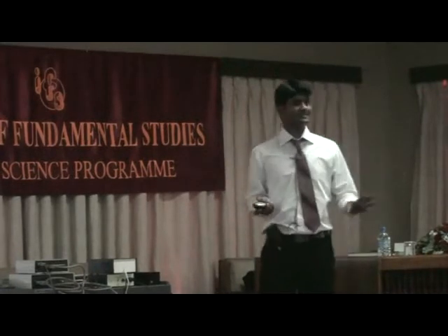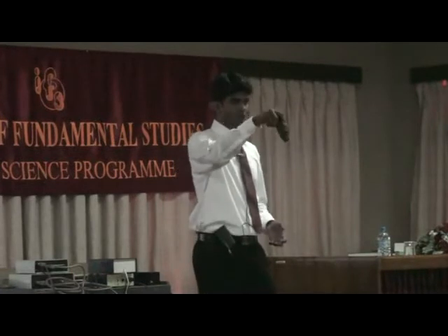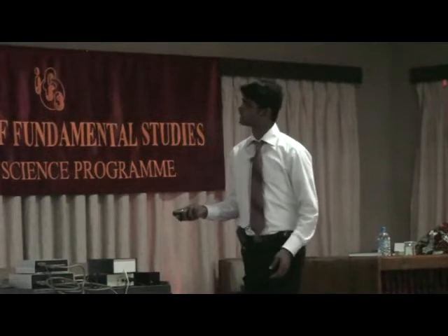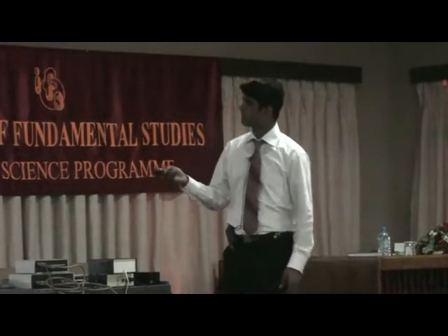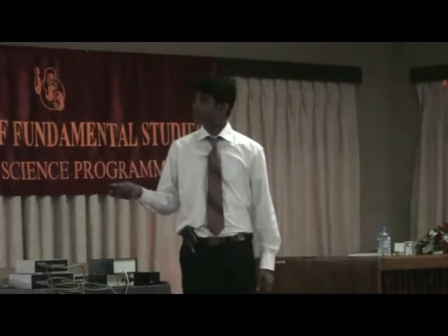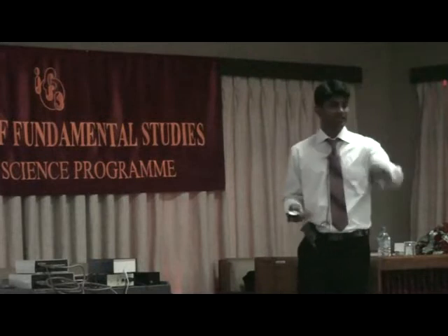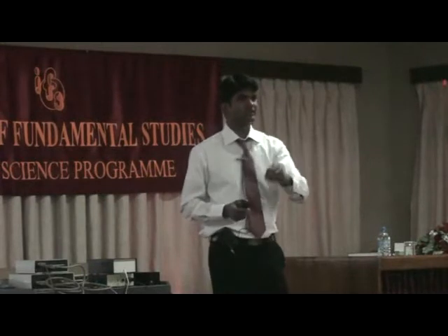What is the difference? In a scanning tunneling microscope, we have a scanning probe, a sharp tip, like the image I showed you earlier. But in a scanning electron microscope, we have an electron gun, which fires electrons. The only difference is that instead of light, we use electrons.